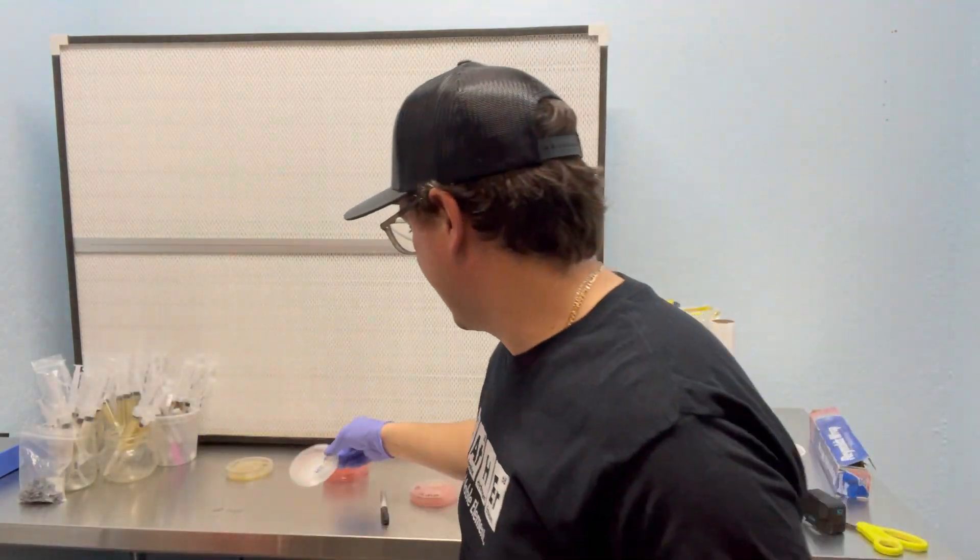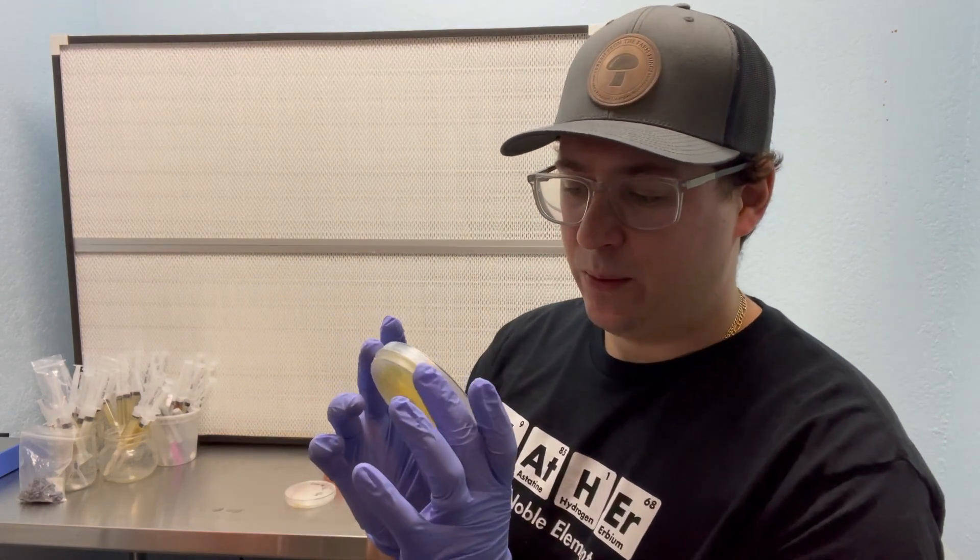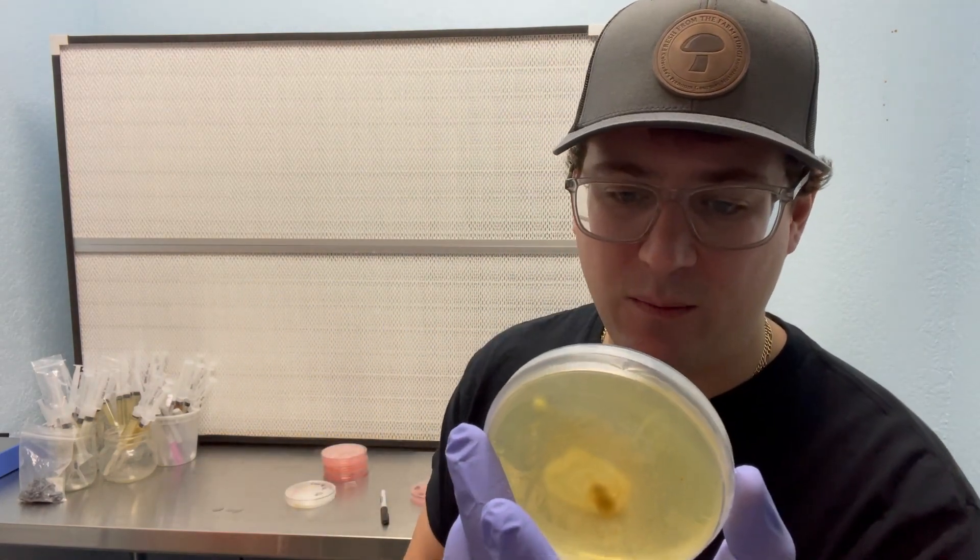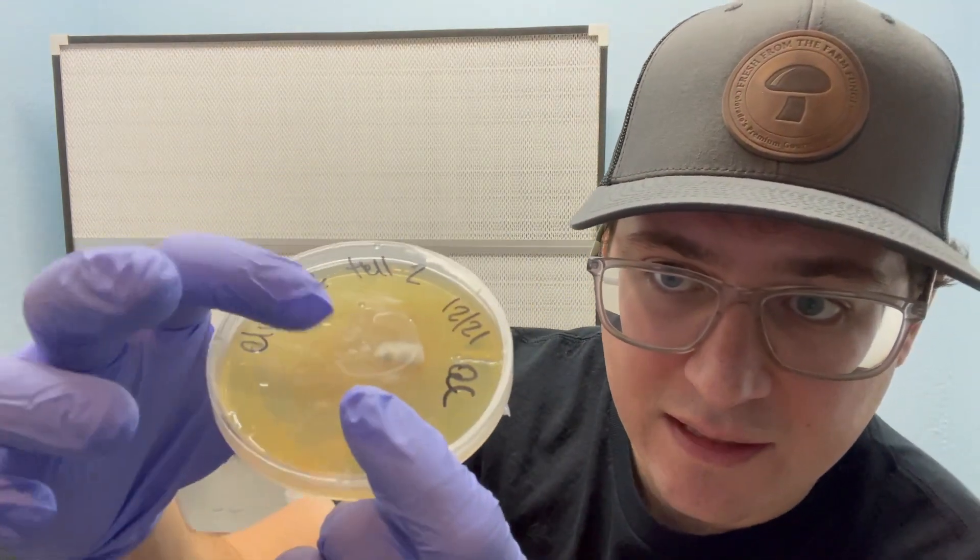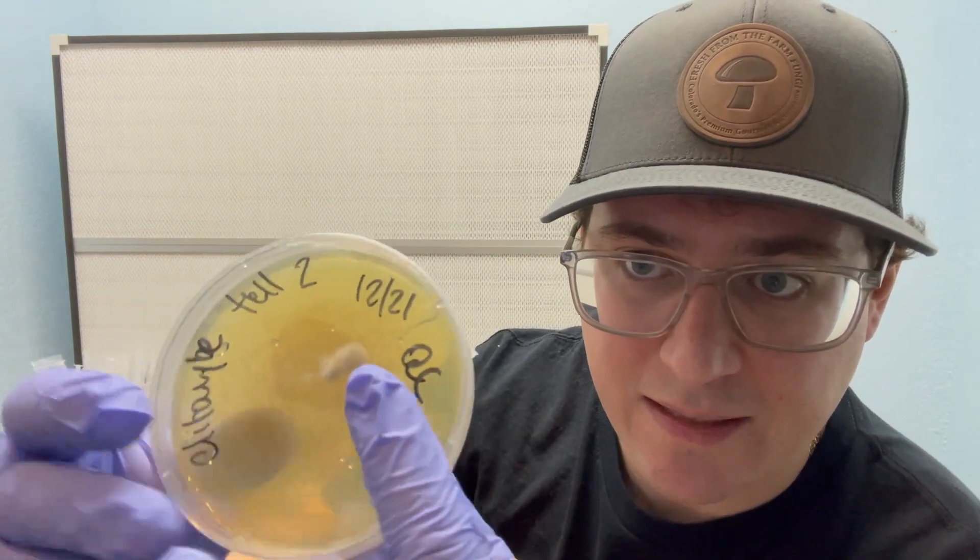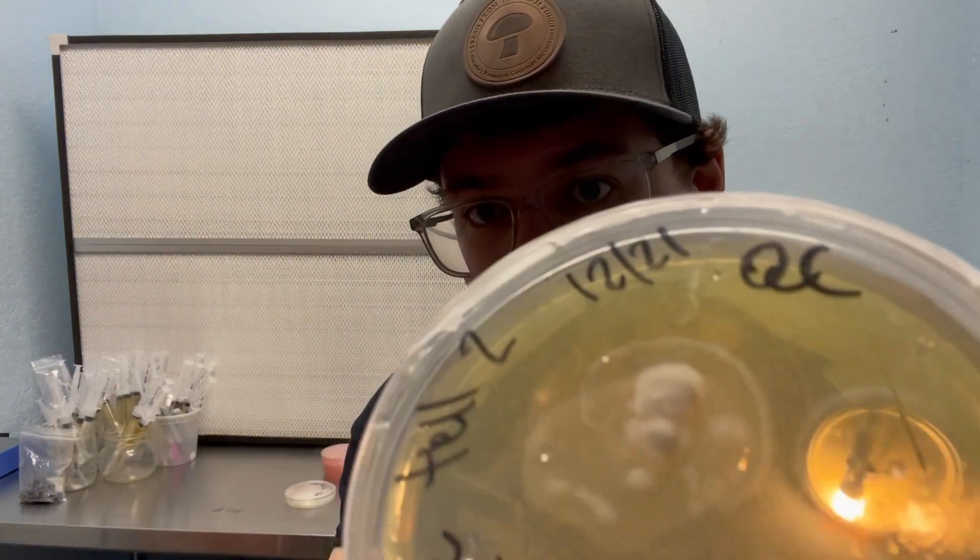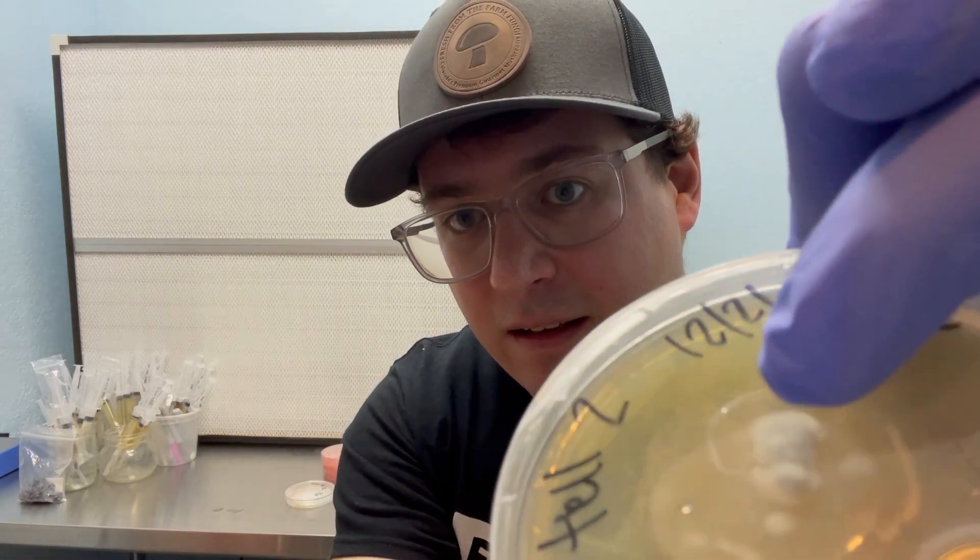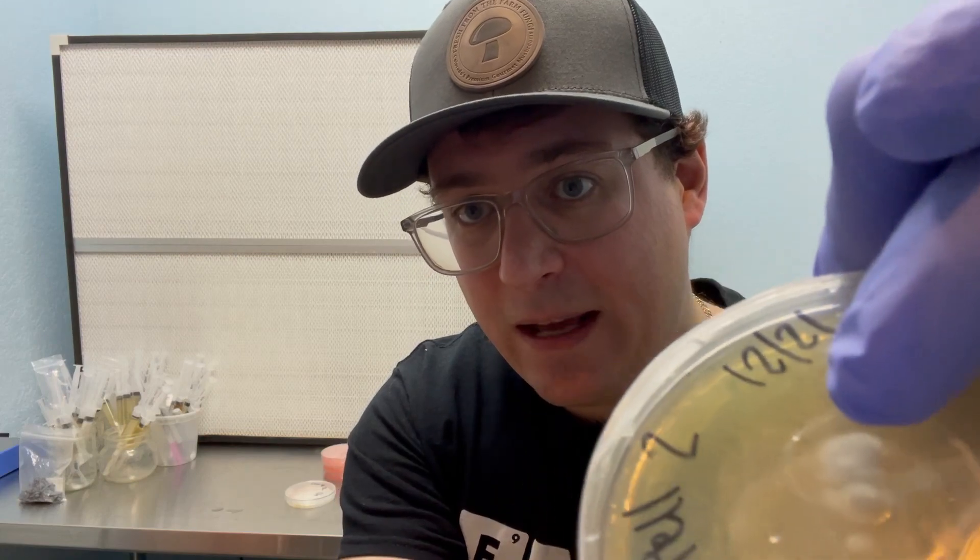But interesting enough, I can still salvage some of that mycelium on the far side. Here's another example of this clitocybe that I've been working on for a few months. It looks like there's this blob of bacterial growth surrounding the mycelium. But there is a clean portion of that mycelium right on the edge there. So I can take from that clean mycelium and transfer it onto a new petri dish to save that culture.